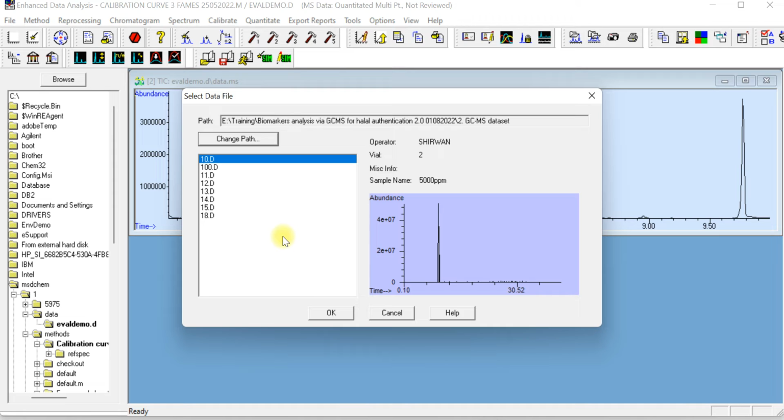Lepas saya tunggu. Keluar tak macam ni? Okay, boleh nampak kan? Why I choose this one? Ingat tak masa kita run the sample in the GC, kita letak number 1, number 2, I don't put name.